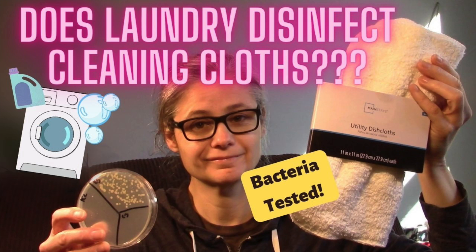Overall, I'm very impressed with the Clorox laundry sanitizer. It was able to remove the bacteria from my cleaning cloths using two capfuls in the fabric softener compartment in my rinse cycle with no laundry detergent. If you're curious how well just a plain laundry detergent removes bacteria, you should check out my video where I tested Tide Pods — I think you'd be surprised at how much bacteria is left on those cloths.